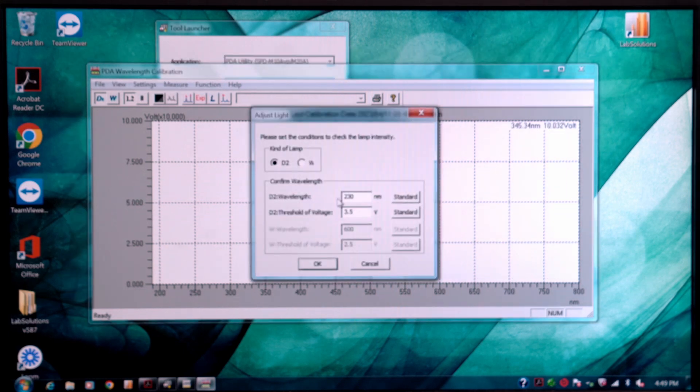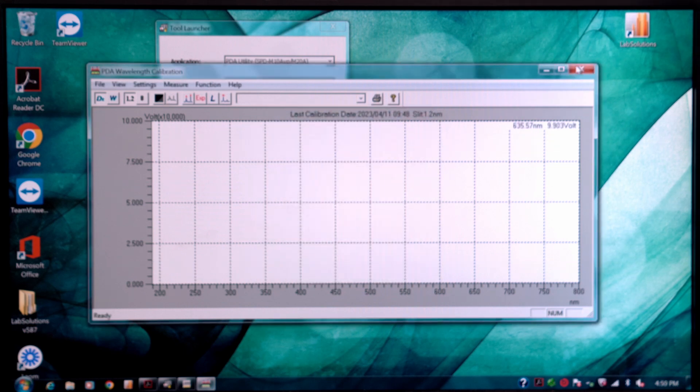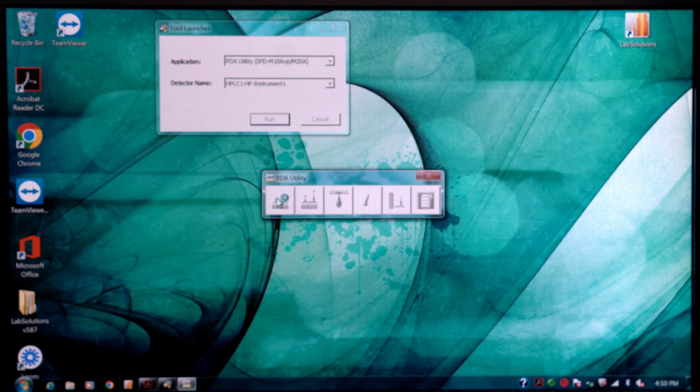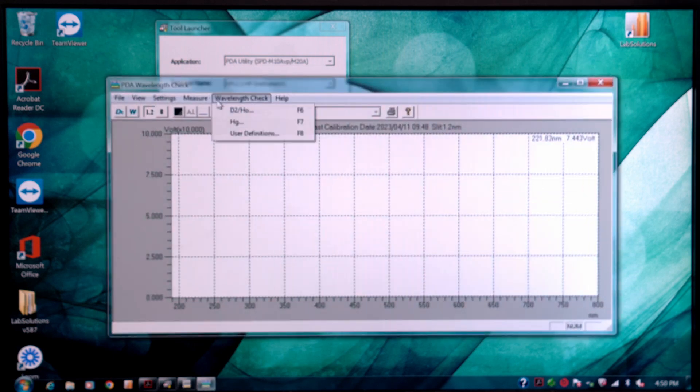The next thing you want to do is to check that the D2 wavelength is 230, 3.5 and the tungsten is 600, 2.5. And if they're not, then change it to these values. And then after that's done, you want to go back and perform the wavelength check again. And then if everything passes, you're good to go.